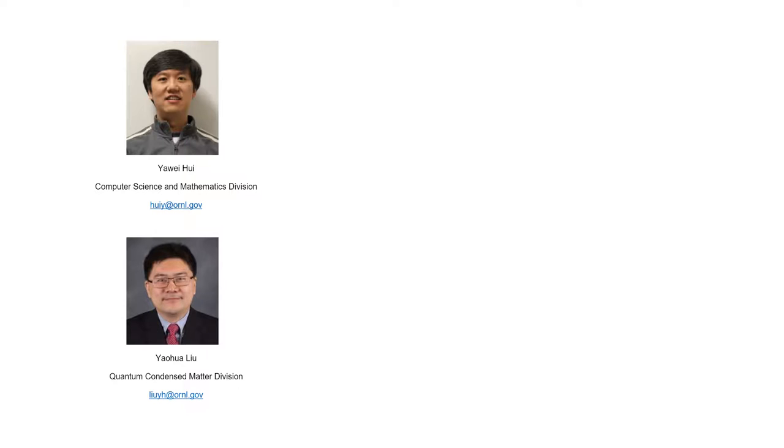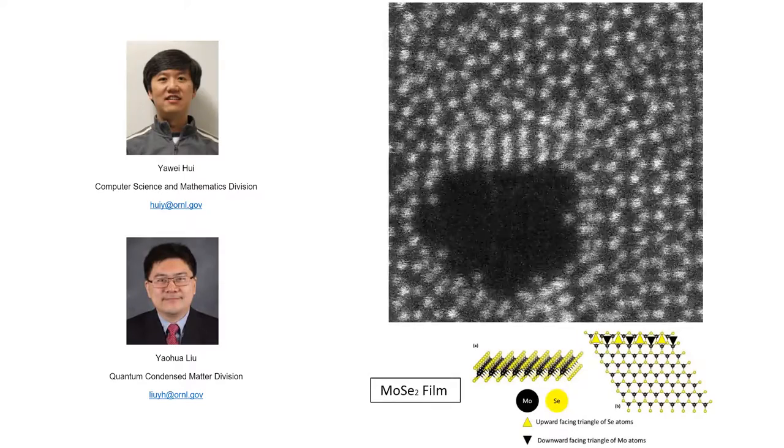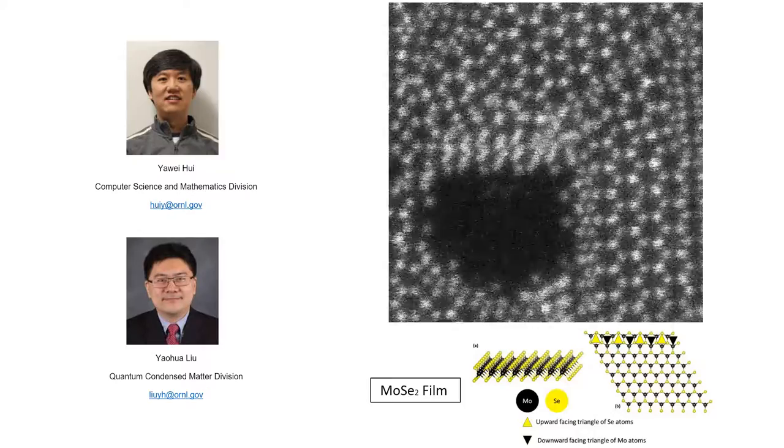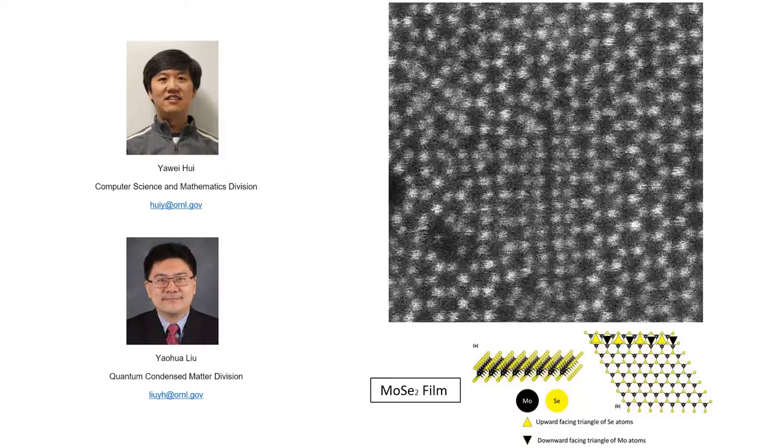I collaborated with Dr. Yaohua Liu at the Condensed Matter Division at SNS and tried to locate, identify, and track the movement of atoms imaged in a series of STEM images.